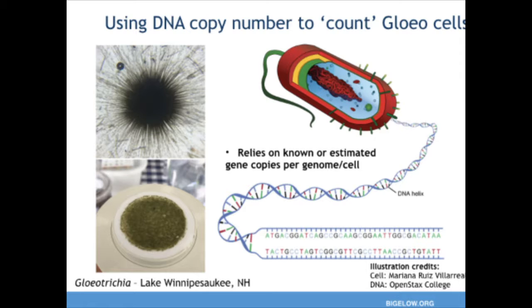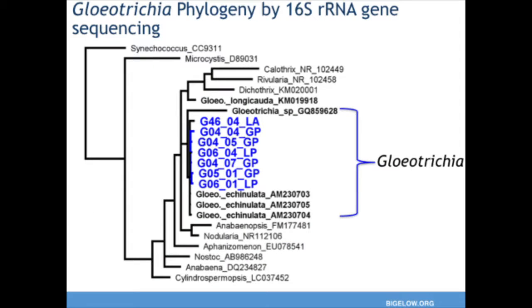So this is what a filtered sample looked like from Lake Winnipesaukee last summer. And typically that's what we're working with. Just looking at that filter, you'd have no idea how many individual colonies, let alone individual cells there were. We did some initial DNA sequencing.